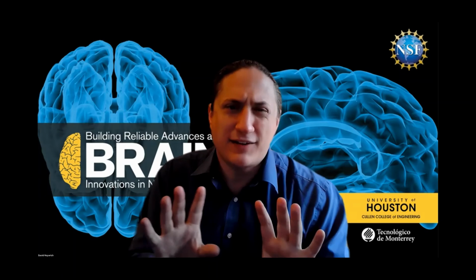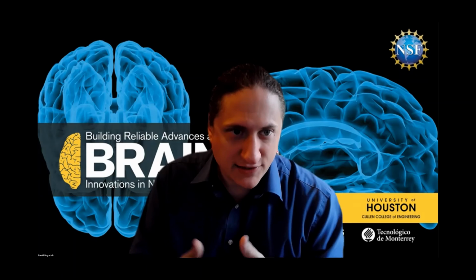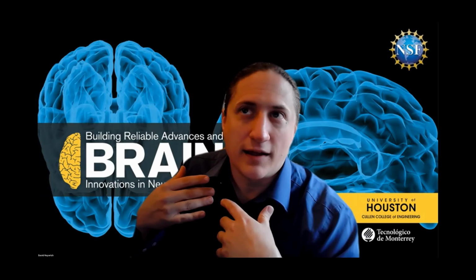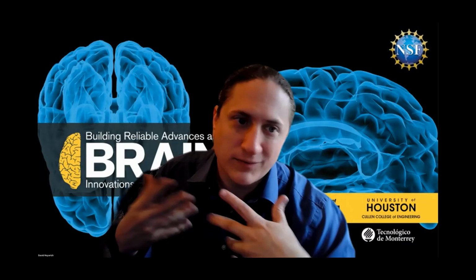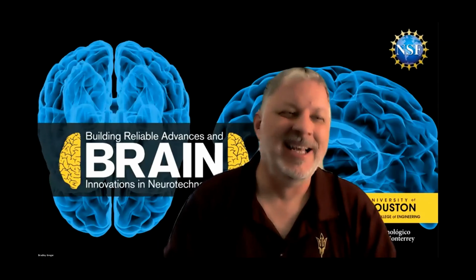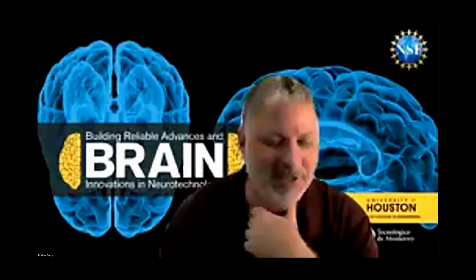But once we get that, that's mostly an engineering problem. Once we get appropriate labels, there shouldn't be any problem with the imaging. As for the structure that's created, technically it's a volumetric data set, a stack of images. In the case of that microvasculature, it's really high contrast, so it's easy to create a mesh from that. I say easy. You have to do a little bit more than thresholding, right? You have to do some intelligent segmentation. But none of that is easy, I'm sure.